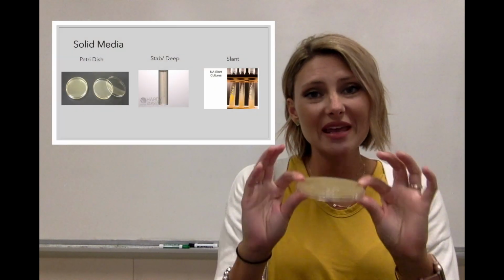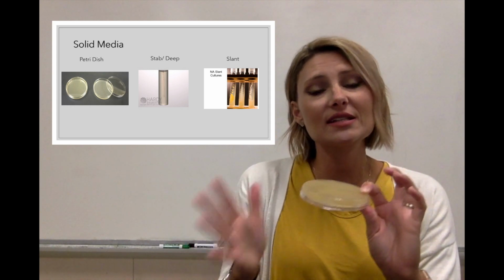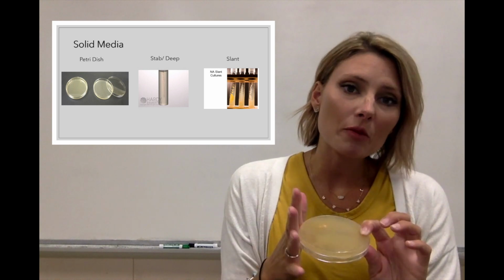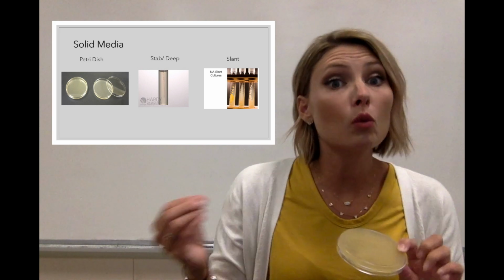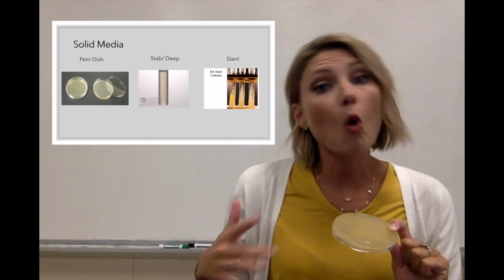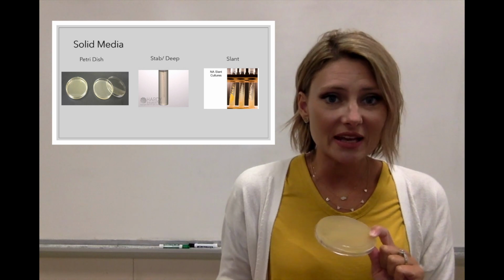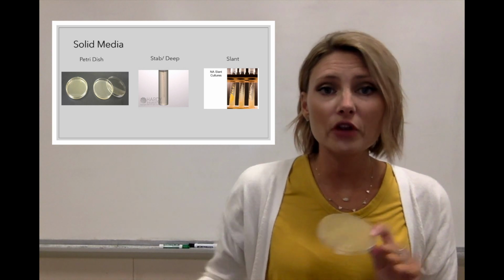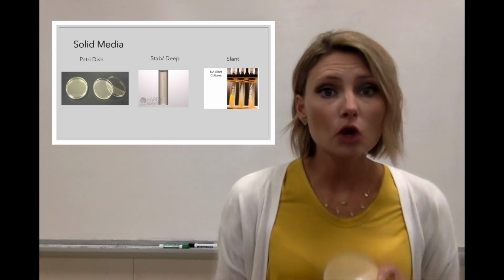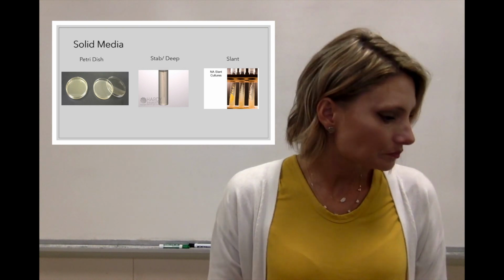And when we are dealing with Petri dishes, we always want to store them inverted, upside down. That helps to prevent airflow and helps prevent contamination. Of course, in microbiology, contamination is what you don't want. That is bacteria that you are not interested in or fungi that gets onto your plate or onto your media and contaminates it. And a lot of times if you're dealing with an unknown, something that you don't know what it is, then you don't even know that it's been contaminated. So that is a huge problem.